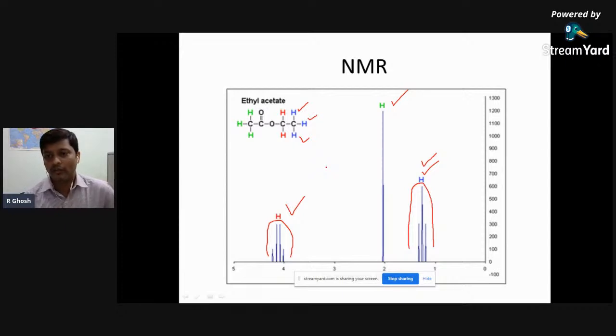And if we are doing all those types of experimental work, at the same time we have to find out if any particular extract is showing bioactivity. Suppose, as I told you, we first took the methanol extract. Suppose it showed promising antimicrobial activity, and then we went for fractionation. Suppose we collected 3-4 fractions, and it was found that fraction number 4 is showing promising antibacterial activity, others are not.